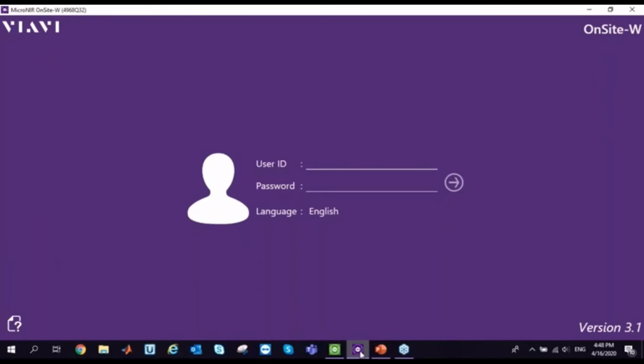And the analyst, the person that is doing the acquisition, is not able to enter in all this procedure that we made together. This is a closed environment that just gives you the answer without touching the method or the models that are behind. So this is really crucial for RMID application, because for using the tablet app, you don't need to know even what is an NIR spectrum.